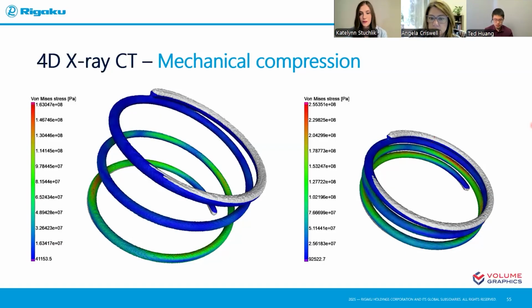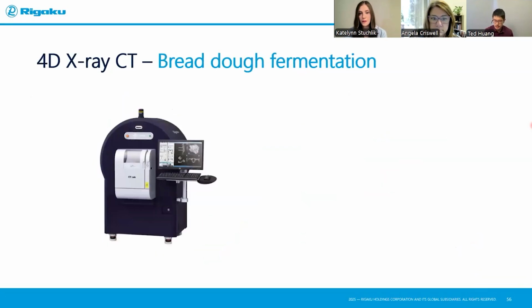Now, this is in situ and with a jig and setup and everything. But if you don't have it and you just have X-ray CT or you just want to do ex situ, you definitely can. So here's an example done by my colleague Aya previously. This is an ex situ study that's very interesting.